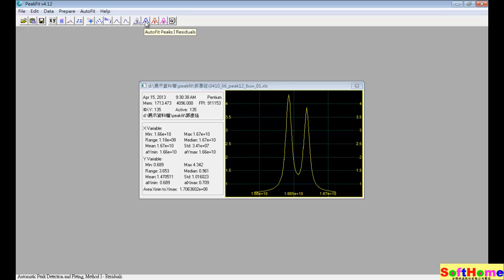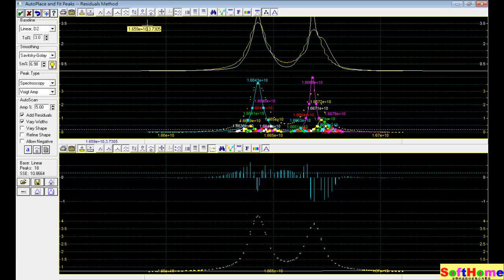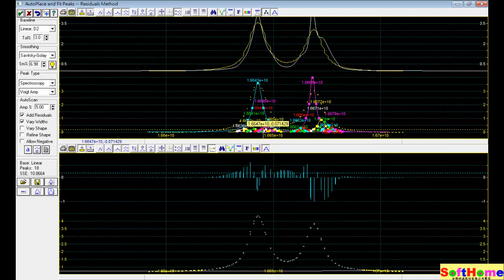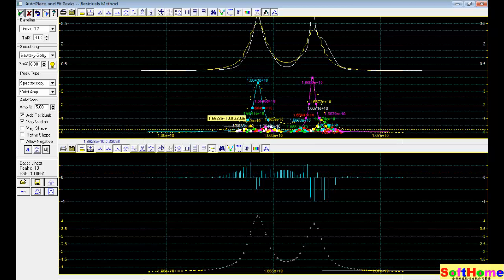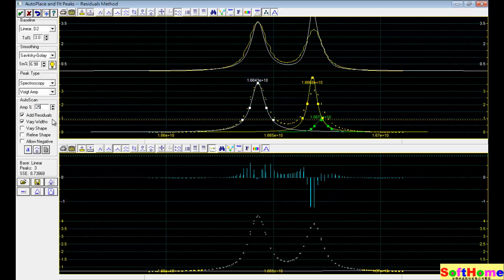We use the first method, residual method, because there are just only two peaks. So we must adjust the threshold. According to this plot, about 25% is proper.